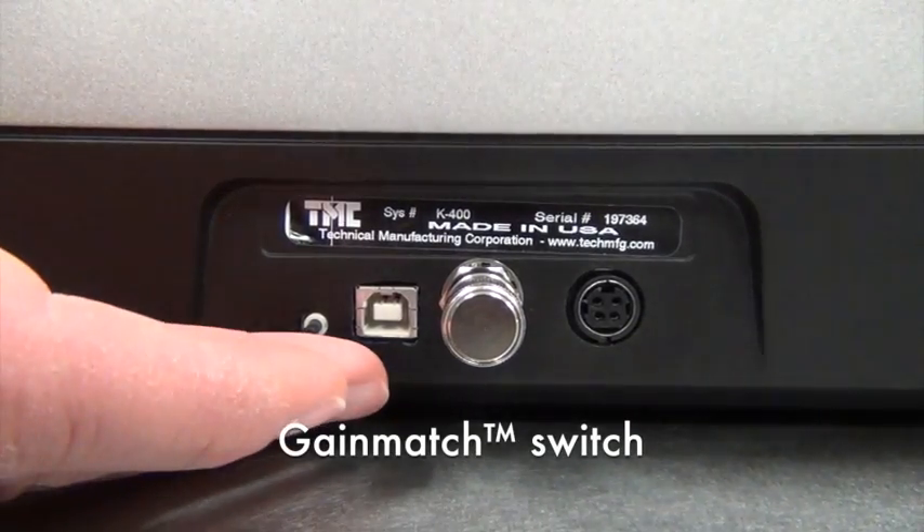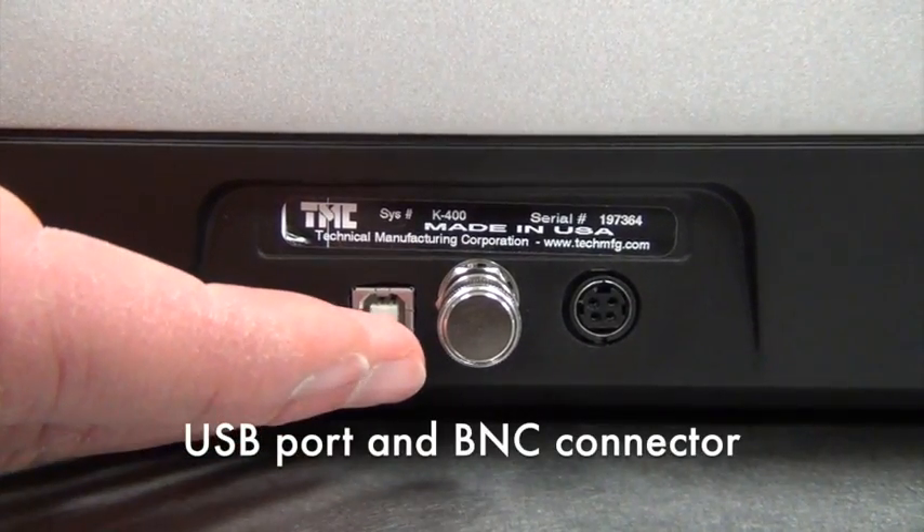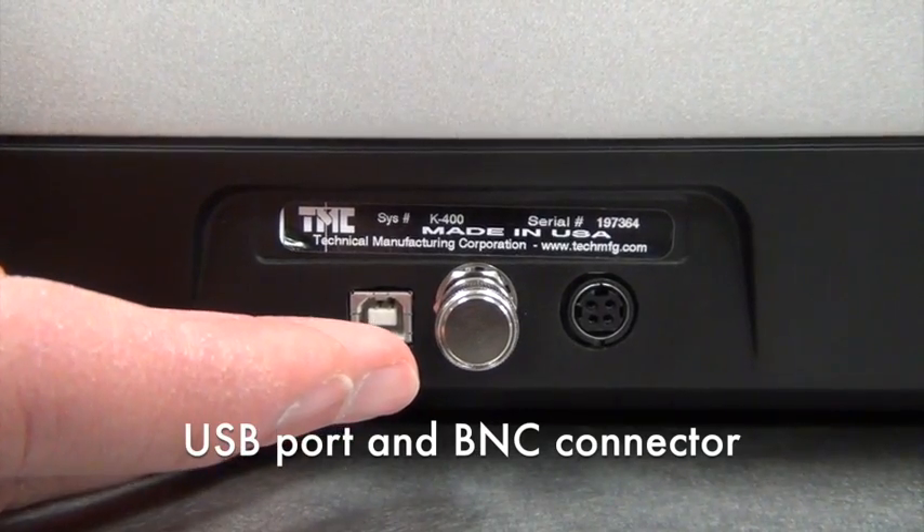On the back of the unit, the gain-match switch is located, which will be discussed later in more detail. Also located on the back is a USB port and BNC connector, both of which are used by TMC personnel.